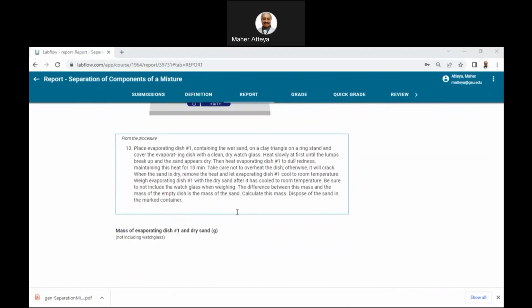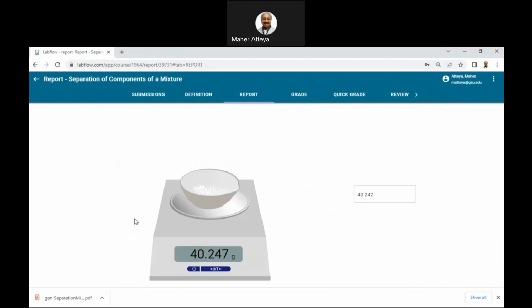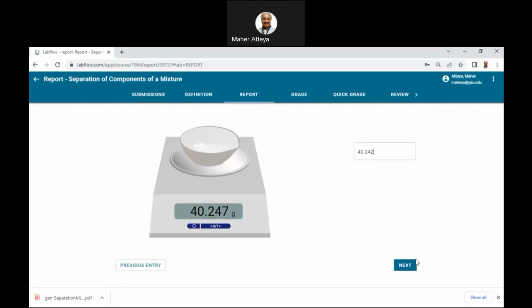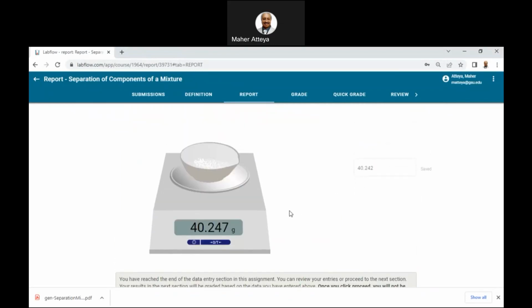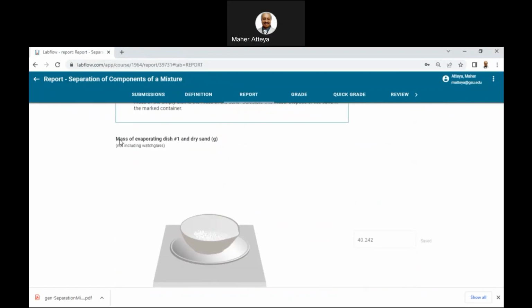And here it asks us about the next. Copy.